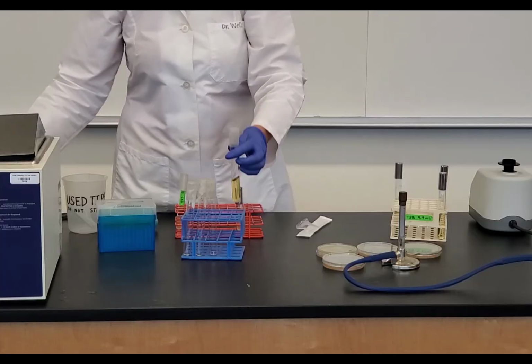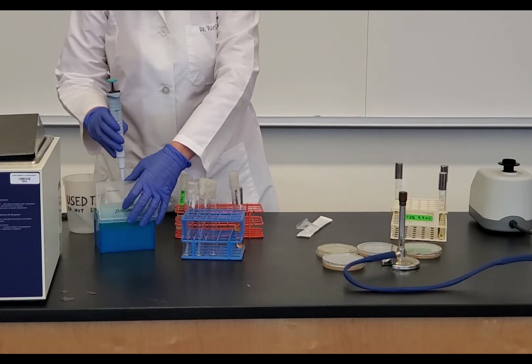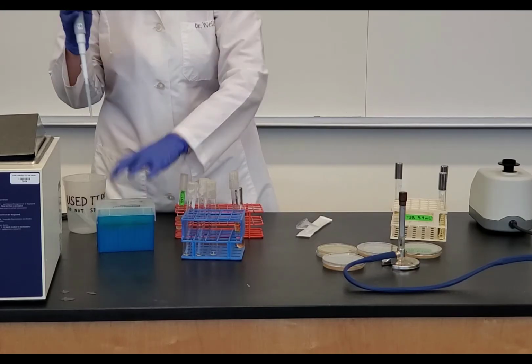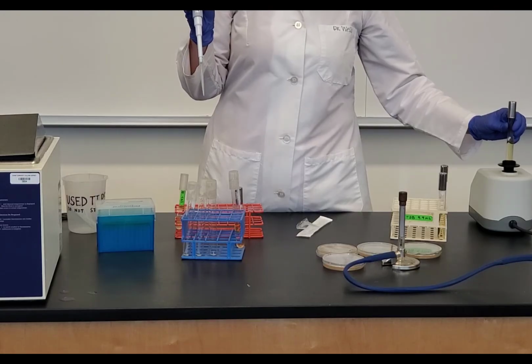Just want to dry off the water. I need a new pipette, so I'm going to get my tip, and I'm going to take my 10 to the negative 6, and I'm going to vortex.